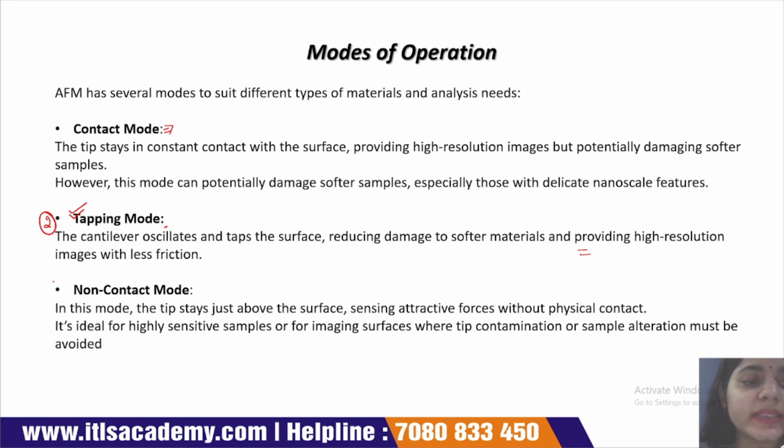Next is non-contact mode. In this mode, there is no physical contact between the tip of the cantilever and the surface of the sample. In the first mode, the tip of the cantilever always makes contact with the sample surface.